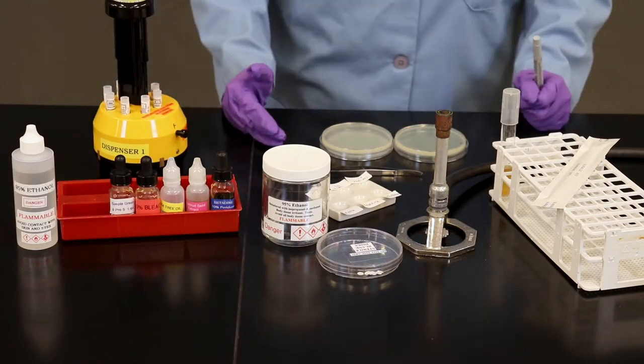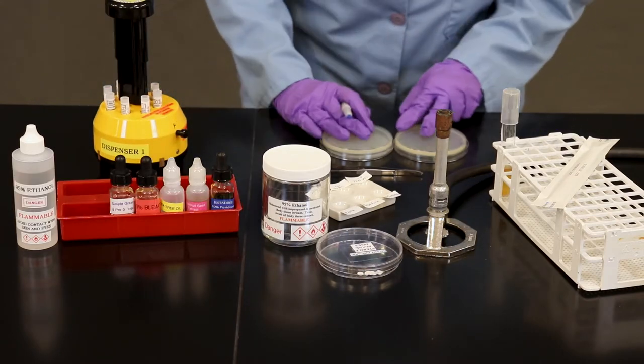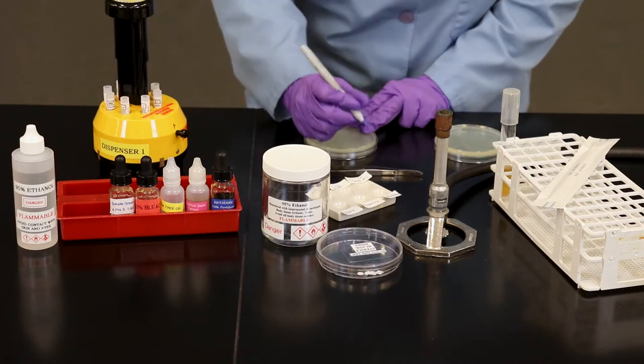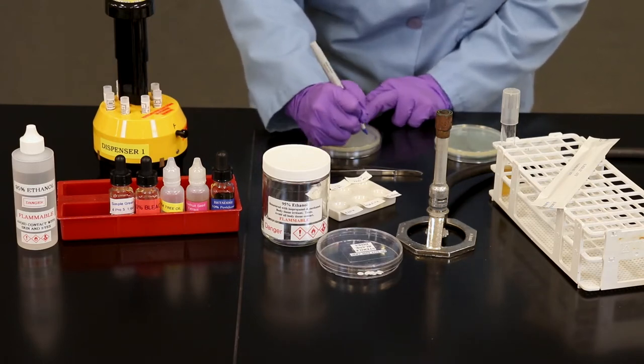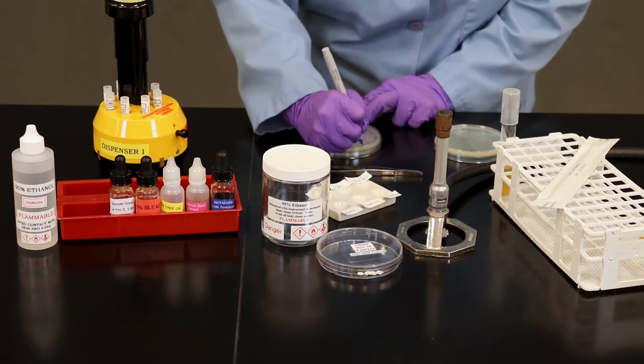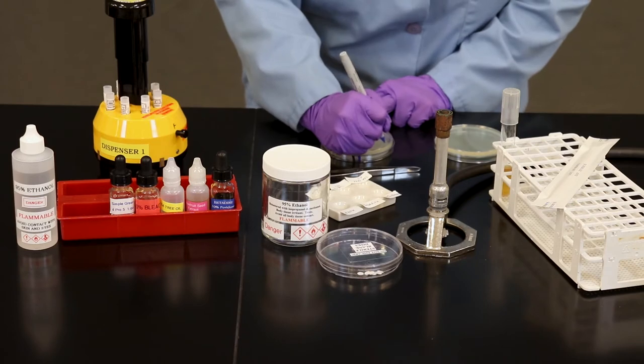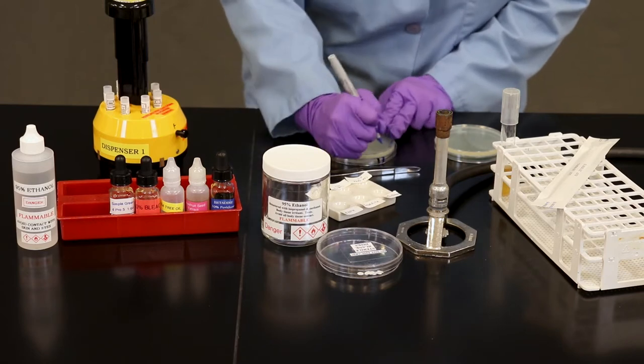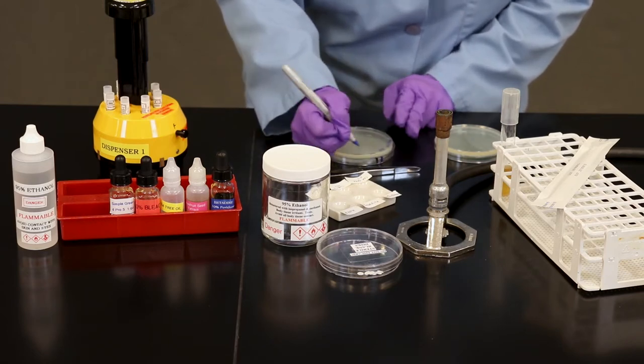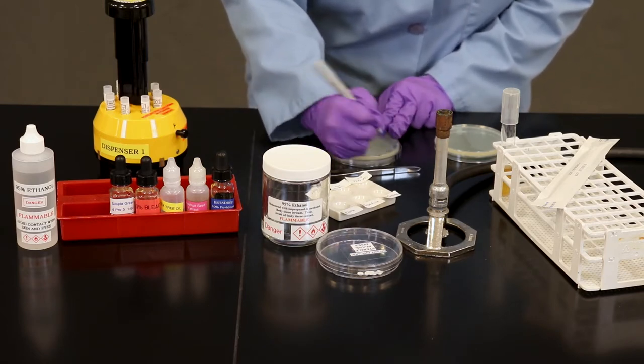Before you get started, you should label your petri plates. On one plate, we're going to note chemical disinfectants. We're going to note Mueller-Hinton Agar, or MHA for short. My initials, the date.